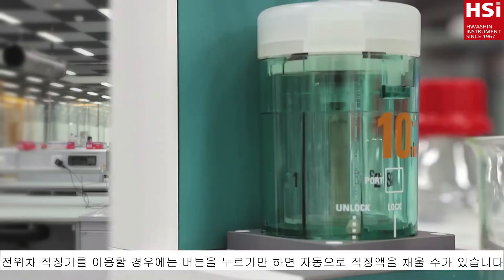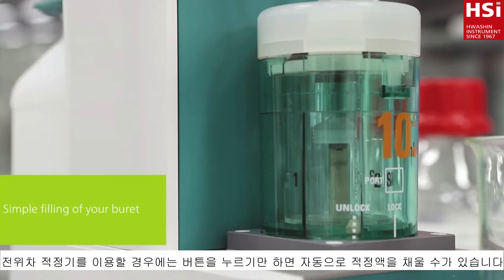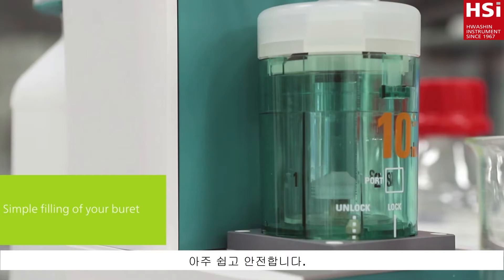With an automated titration system, all you have to do is touch a button and the burette is filled. That is simple and safe.